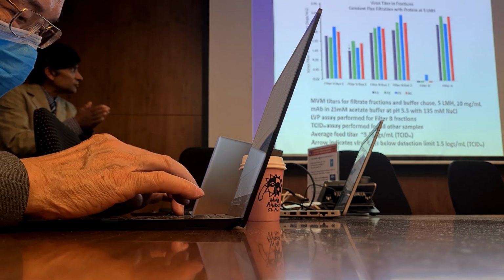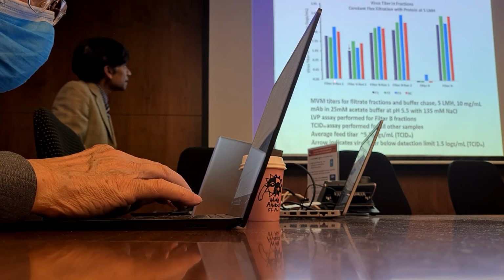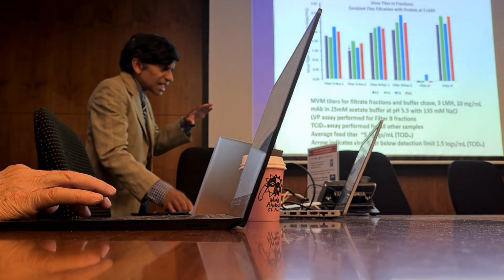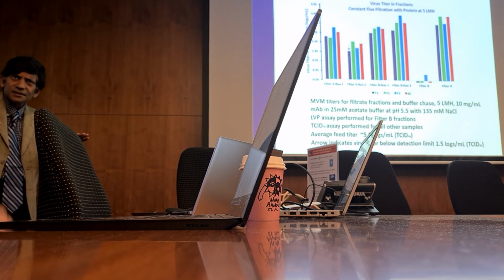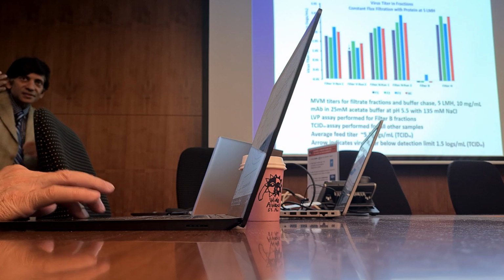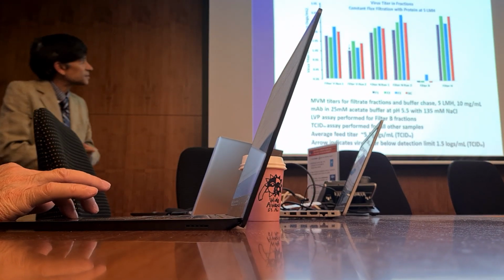Fraction 1, fraction 2, fraction 3. Each of these fractions is about 50 ml. These fractions are worked out so that every filter, which has a slightly different membrane surface area because manufacturers make them with different surface areas, will be subjected to the same throughput. Okay, you have the same amount of permeate collected per membrane surface area, normalized by membrane surface area.